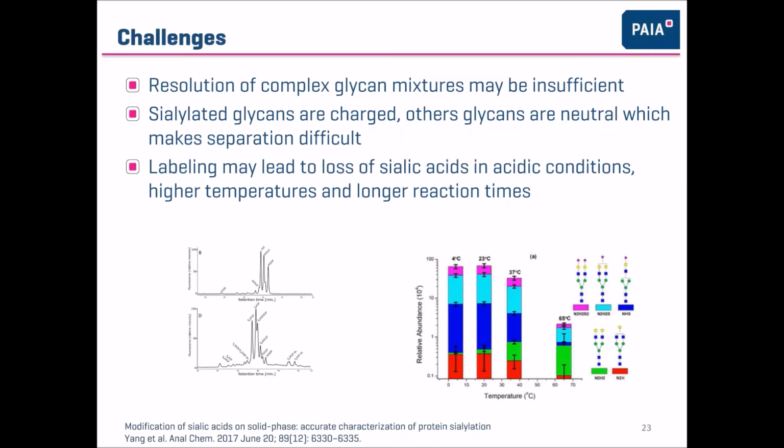And that's also the reason why sometimes people have one process which is only focusing on analyzing charged glycans, and another method that only looks at neutral glycans, and afterwards the results of both methods are combined to give the complete picture.